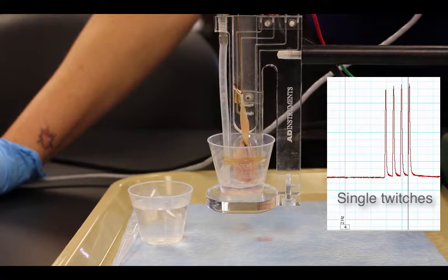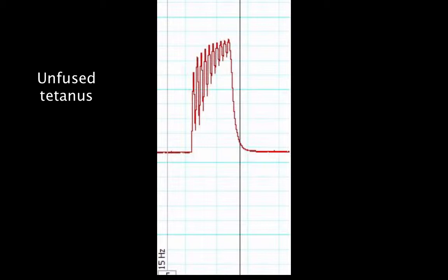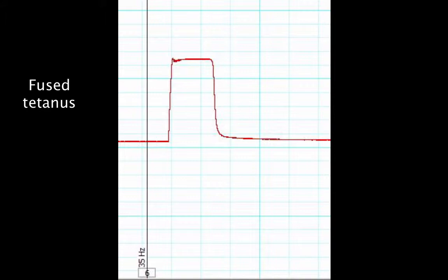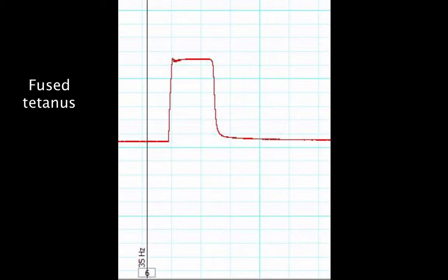To measure temporal summation, we start with low frequency stimulation to generate single twitches which relax completely in between stimuli, and then increase the frequency to demonstrate unfused tetanus where there's relaxation between twitches, and fused tetanus where the muscle stays contracted and there's no loss of tension between twitches. And finally, at high frequency 60 hertz, we see fused tetanus and then fatigue as the muscle keeps losing tension despite repeated stimulation.